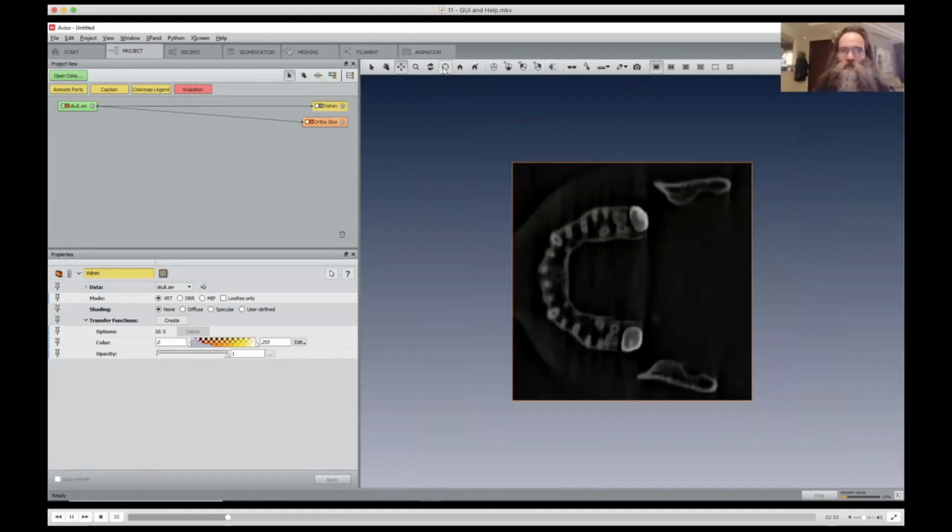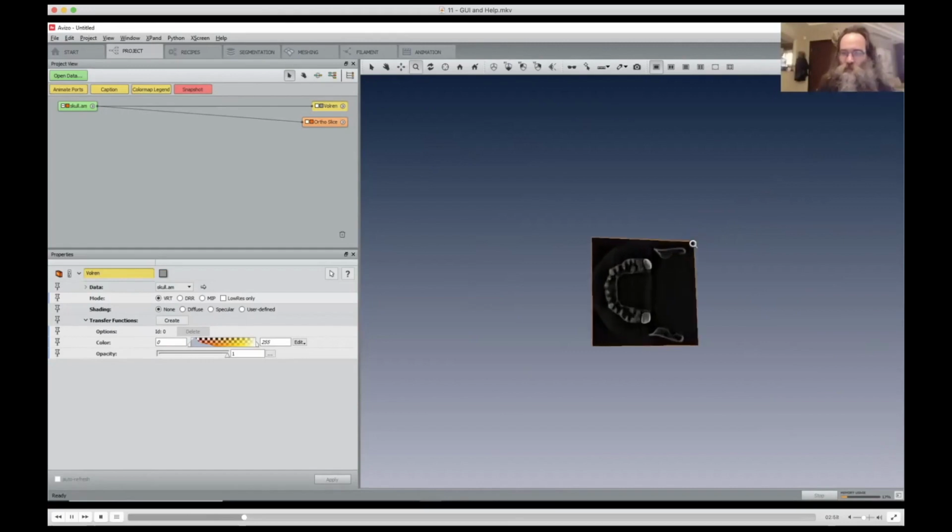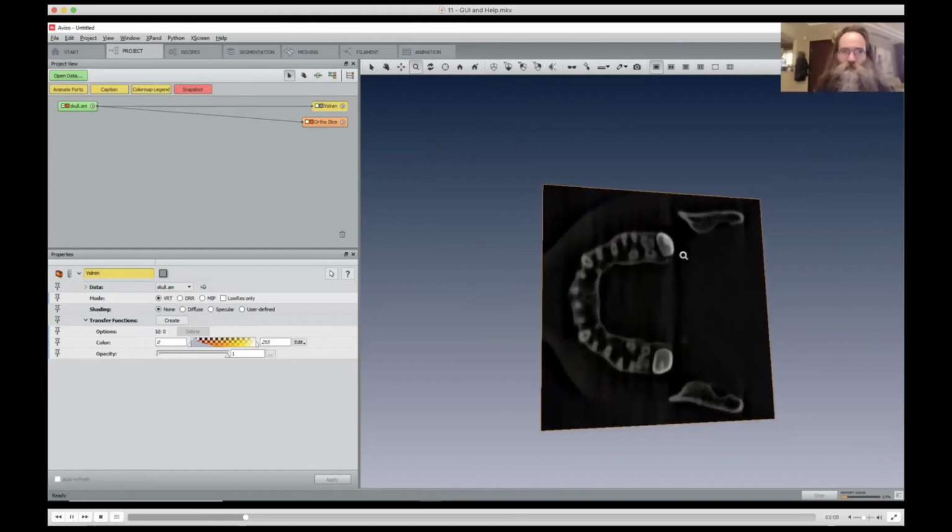That one button here, which says seek, lets you actually select. Let's say you have a lot of objects, many more, and your slice is just a small one somewhere, let's say on the top right. You use the seek button and press it, select it, then Avizo will move it somehow in the center. It's sometimes useful. In this case, probably not zoomed in enough, so you might have to adjust a little bit, but it's rather useful. Okay, so you already know these 4 buttons here.